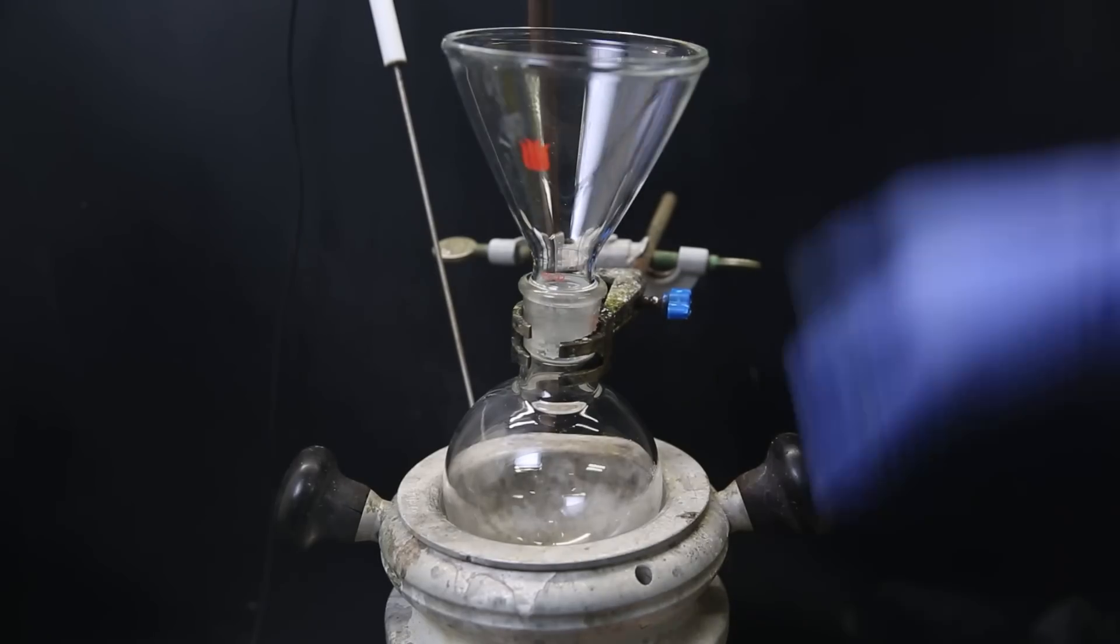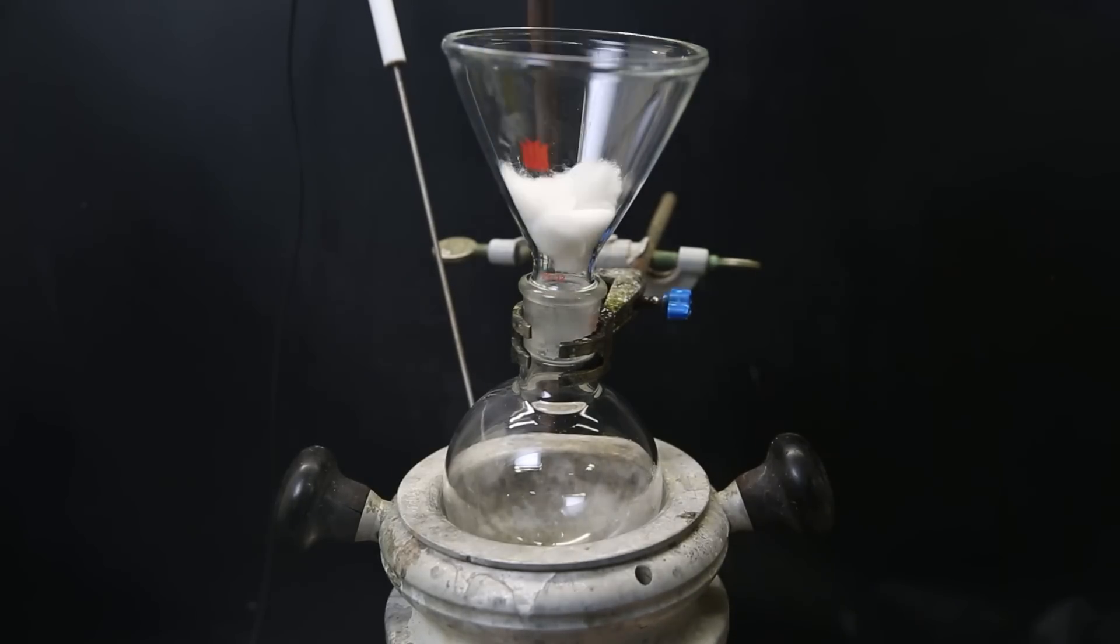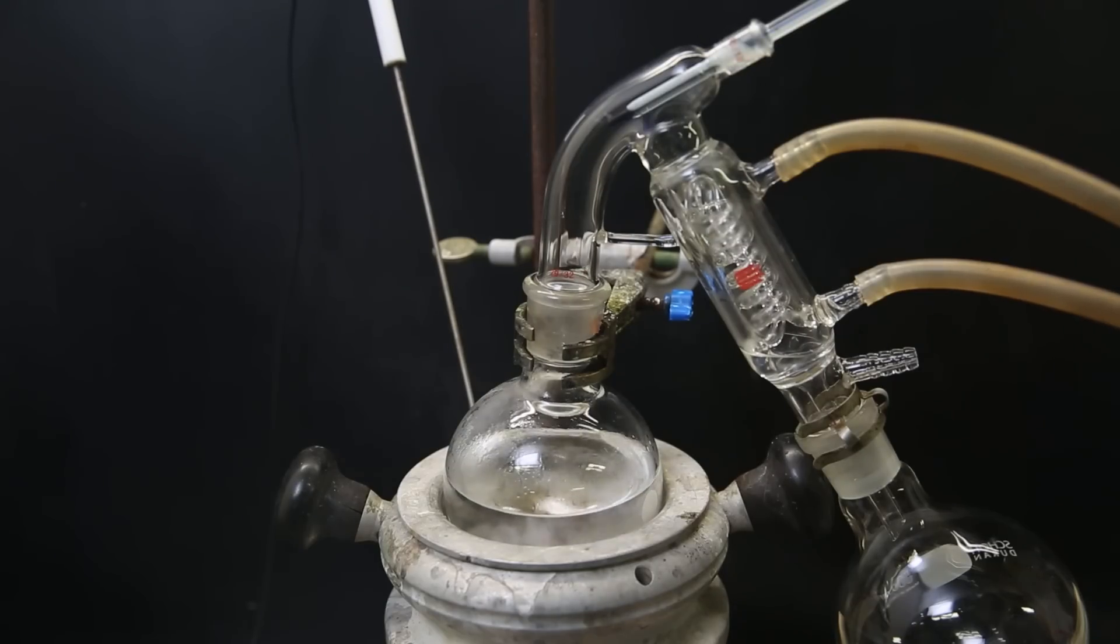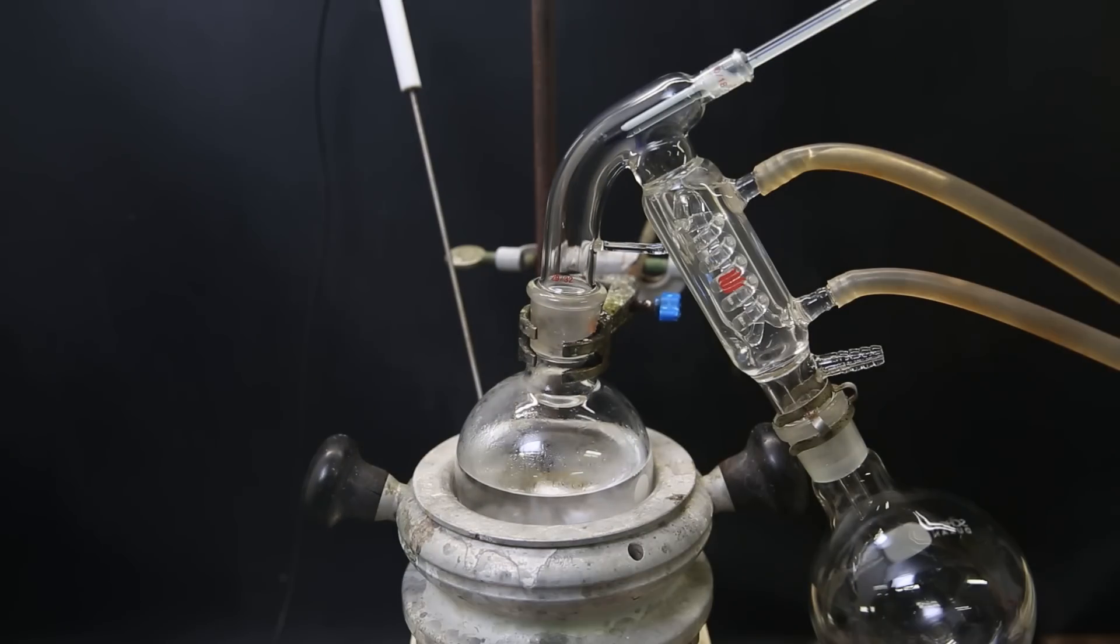I then set up a flask in a heating mantle and filter the dry dioxalane through some cotton. I hold the funnel up so that the air can move, and I then add a stir bar. Now I set this up for distillation to distill off all of the dioxalane, which has a boiling point of 74°C.